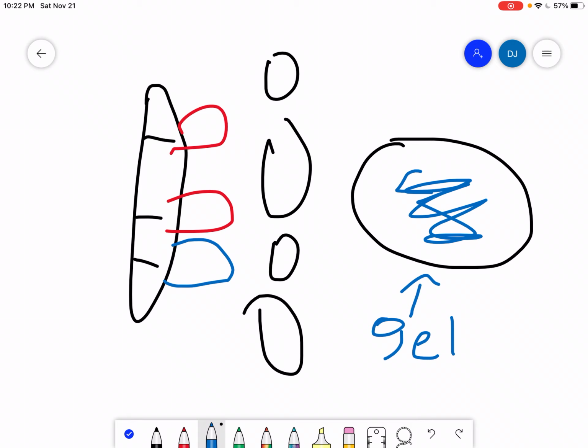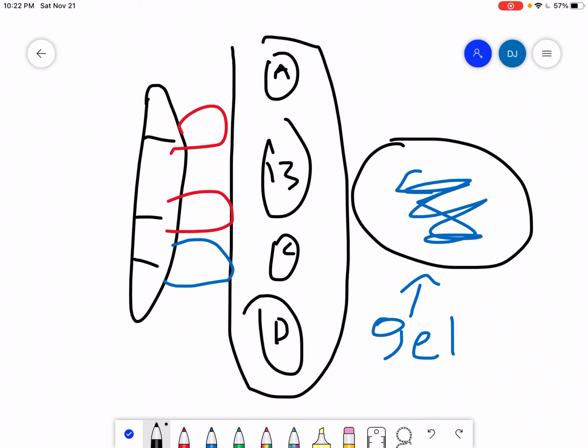And let's say we label this A, B, C, and D. Let's say I want to find B, right? What we're going to do is take these fragments we have over here and transfer them into the gel. Now, think about it. After we do this, what are we going to do now? We've transferred it, and I really don't know what to do. What should we do?